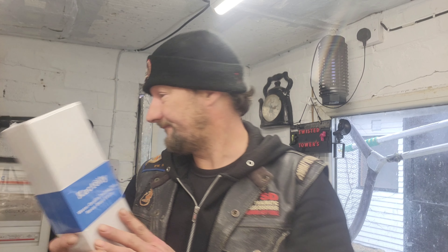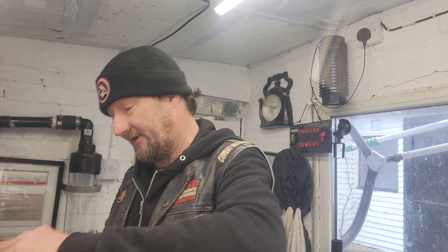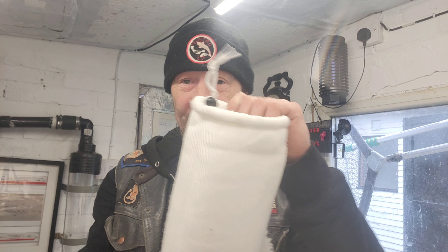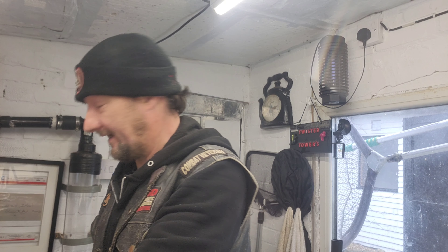Water quality testing has never been easier, so let's fire into it. I've got a pair of scissors here because I haven't even opened this myself - I thought we would do it together on camera. I'm a little gutted because when it arrived I thought it was covered in packaging, but it turns out it comes in this beautiful fleecy bag.